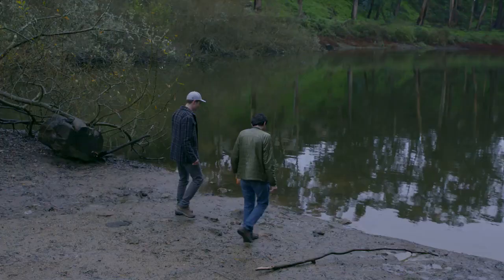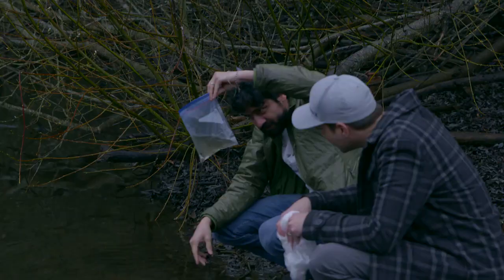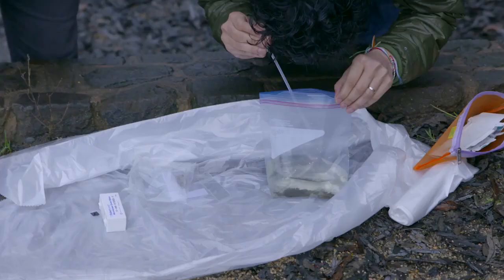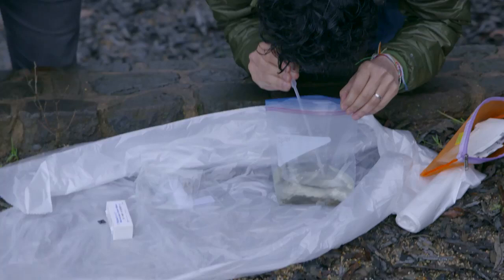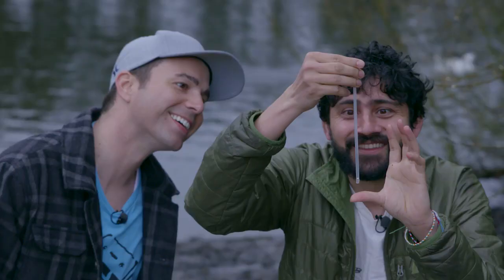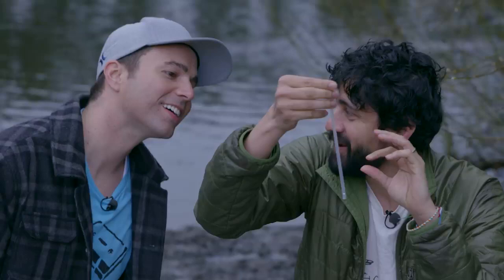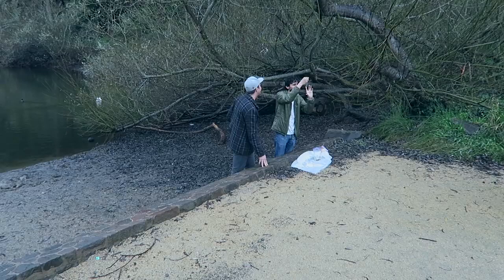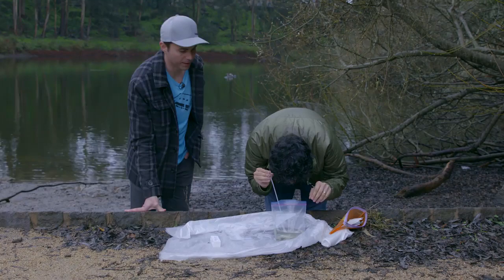I wanted to test drive this paper microscope, so we got a scoop of seemingly clear water from this pond. There was one tiny white speck that didn't settle to the bottom of our bag, so Manu suggested we take a closer look. They can sense suction and they run away — it's kind of like a fly when you're trying to swat it. It senses your hand coming, just like it's about to go into the mouth of a fish, and it runs away.